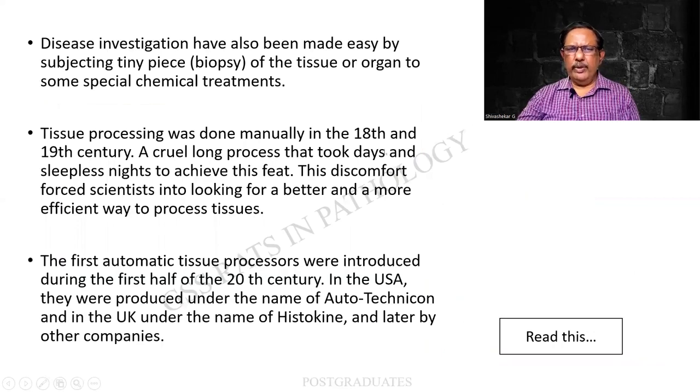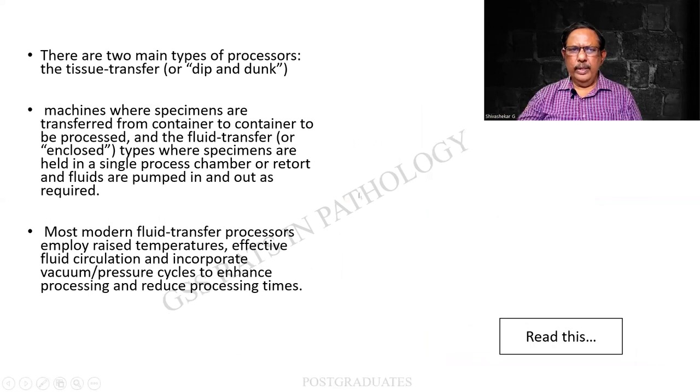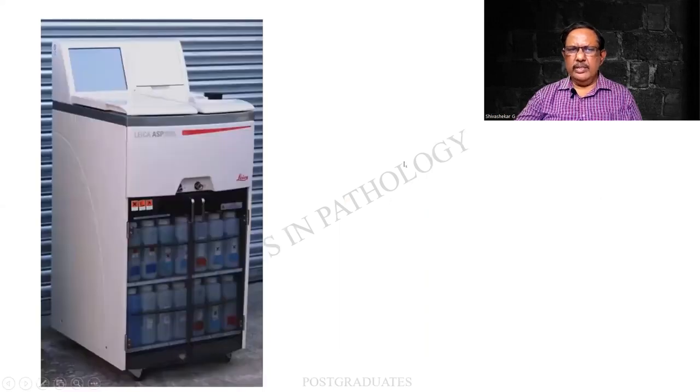This I would like you people to go through leisurely. Something that I already explained, and what is the history of the histokinette, and how, going into the 18th or 19th or 20th centuries, it came into vogue. Also, there are two terms that I would like you to observe: dip and dunk. And what is this? I shall be showing you.